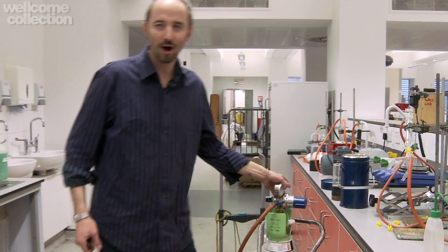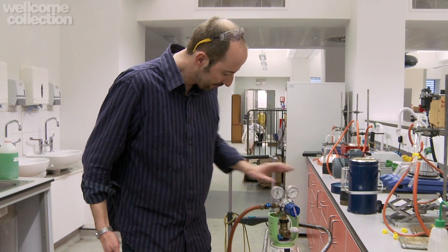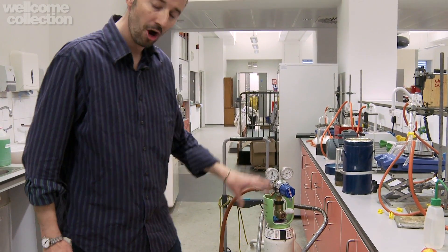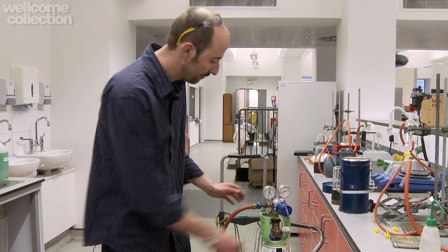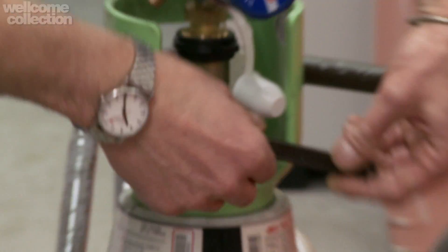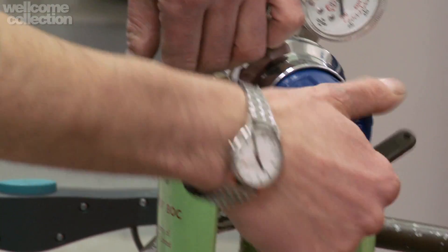First of all, you can't make oxygen. Remember, it's an element, so it's already there. But what we've got is oxygen in a cylinder. These black cylinders with white shoulders are always the telltale sign that what we've got is oxygen. It's a pressure regulator over the top, and what we'll do is open the cylinder and start blowing the gas through this hose.